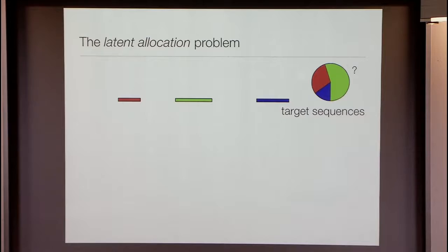All right, let me just conclude with one last piece. I know everybody's a bit tired, and 1.5 hours is a long time. There's a final problem that goes along with read alignment that I haven't discussed, but that's crucial to it. And that is that the reads actually came, you believe they came from the targets. That's the model here. There's no evolutionary relationships.